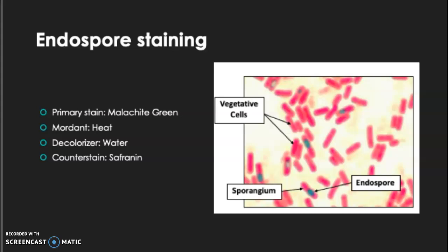To perform an endospore staining, allow the slides to dry for approximately 1 minute and then heat fix the smear. Place the slides on the staining rack and flood with malachite green. Heat for 5 minutes by placing the slide on the wire screen above the boiling water in the beaker on the hot plate.